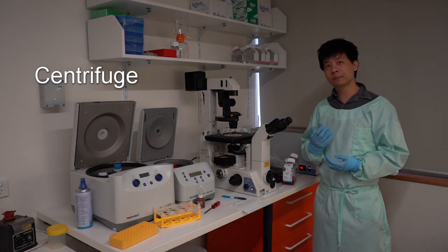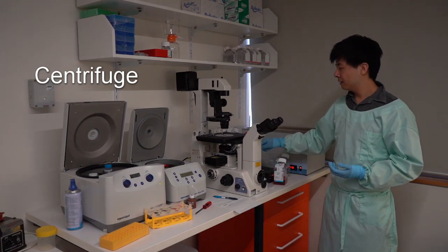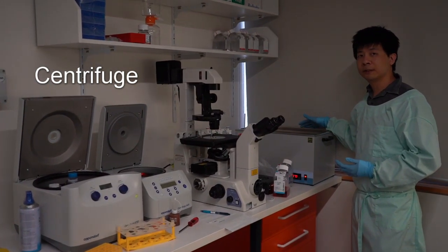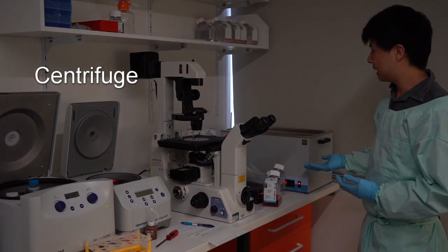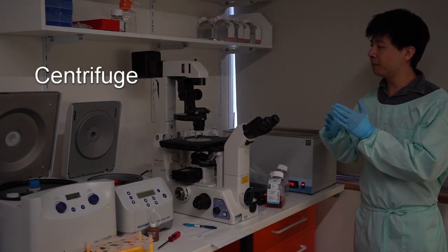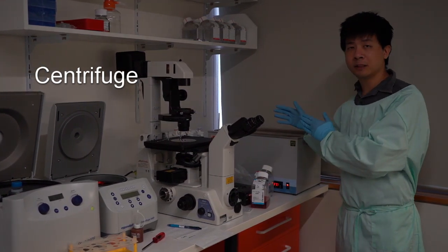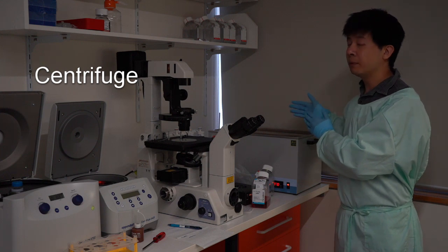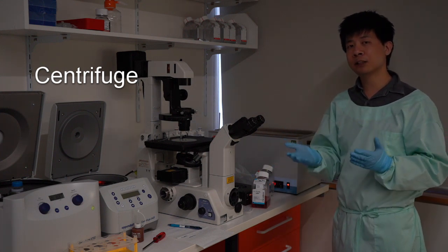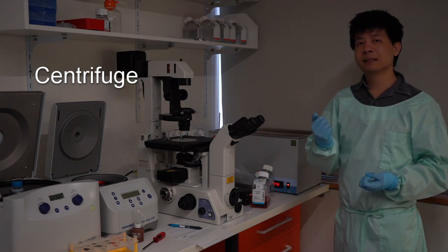Here we have a standard light microscope, which is important to visualize the cells. Finally, we have a water bath incubator set at 37 degrees Celsius. Just before we start cell culture, we insert any reagents and cell culture media about 30 minutes beforehand to warm them up, so that when we passage the cells they are kept at 37 degrees Celsius.